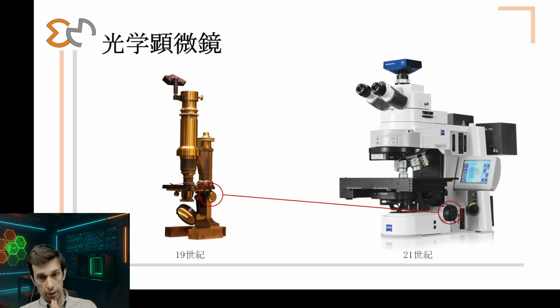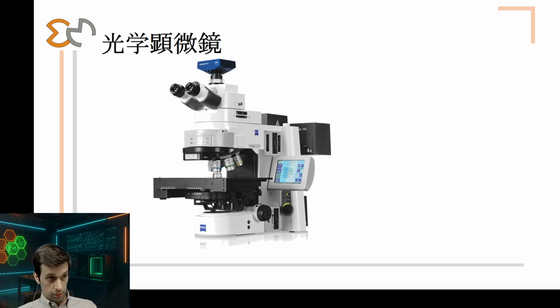And then we have something to regulate the distance between the lenses and the surface of the sample. This is because every lens only works at a specific distance, with a very narrow depth of focus. Depending on the lens, lenses with lower magnifications can observe wider, rougher surfaces. Higher magnifications can usually only observe very flat surfaces. So this is a modern optical microscope with everything.